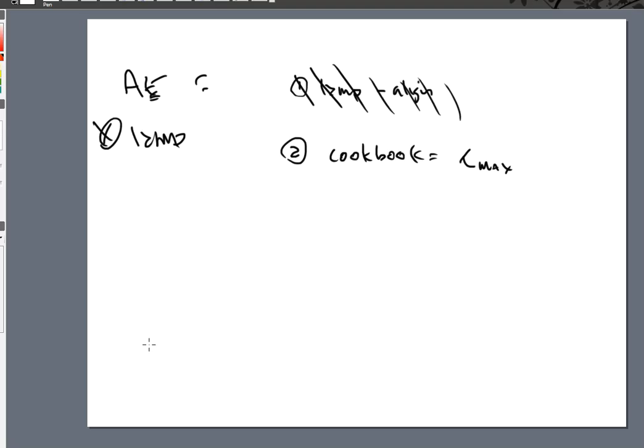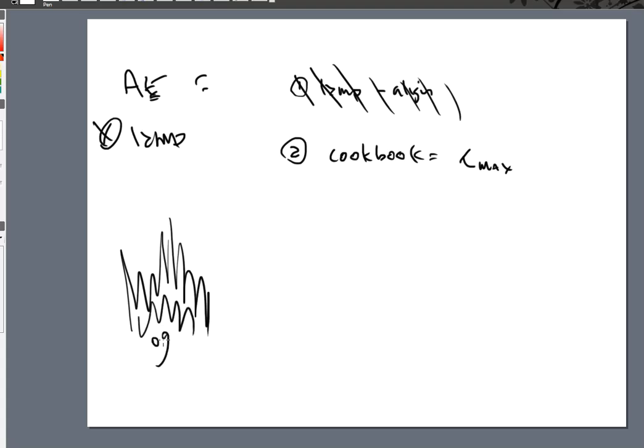And that's because poor little sodium is getting ready to go into a flame, and it's getting ready to burn, and we're getting ready to destroy it. Oh no, sodium, I'm so sorry. Well, when sodium goes into that flame, it screams, and it screams wavelength, and we need to pick that wavelength up by the detector.